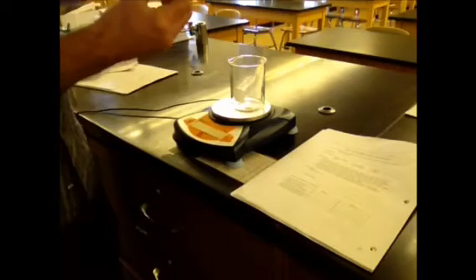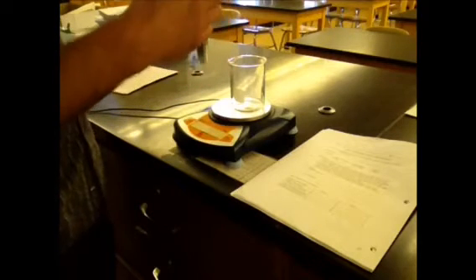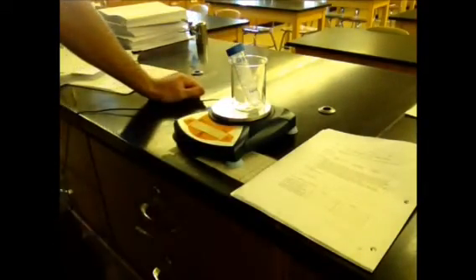Now, when you release this, and I'm going to do this before it's done, because we're not going to wait for it, but when it's done, you won't see any more bubbling, you're going to release it, and you might hear a little bit of a noise at this point. No, I didn't let enough gas build up. And you're going to put that back on the balance, and you're going to write down the number. That's what you get for mass after releasing gas. And then you do a little subtraction for mass of the gas in the vial.